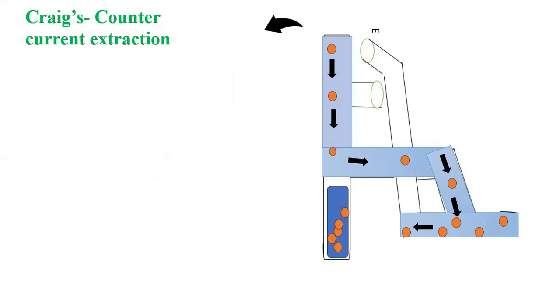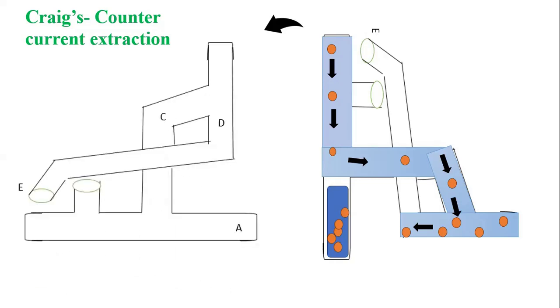Now again we are going to rotate this tube in the reverse manner, meaning we have to reverse this one. Once we reverse or rotate it again by 90 degrees, the tube is positioned in this way, okay. So what is the content present in the D tube? This is tube D, okay. Which tube? D tube.